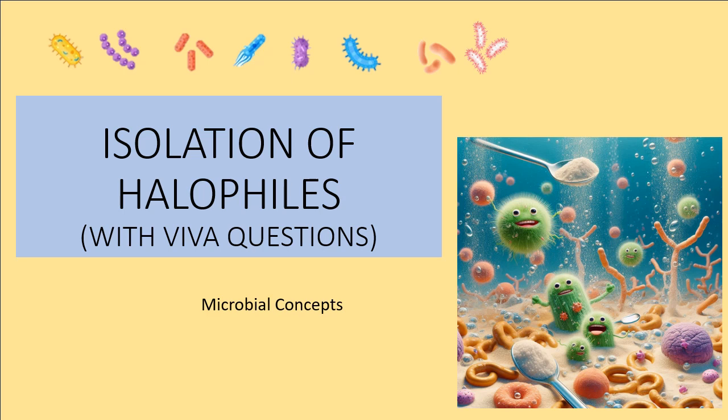So you might have a different topic for your practicals, like studies on halophiles isolated from seawater, then pigment isolation or pigment production, or salt tolerance, etc. It might vary a little bit from this video, but the method of isolation of halophiles and then identification is the same.